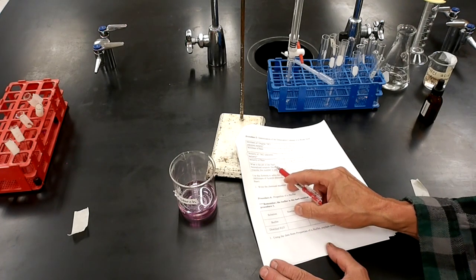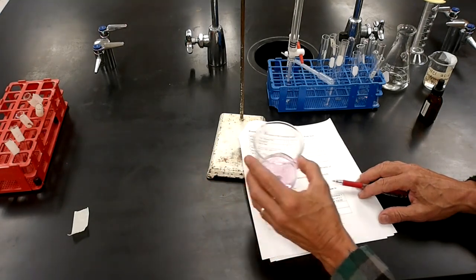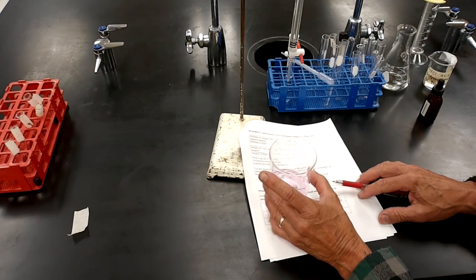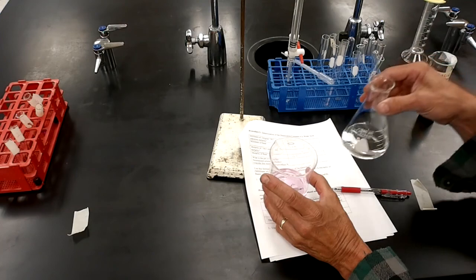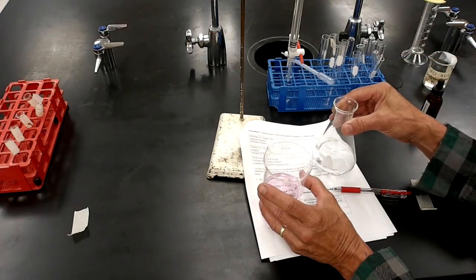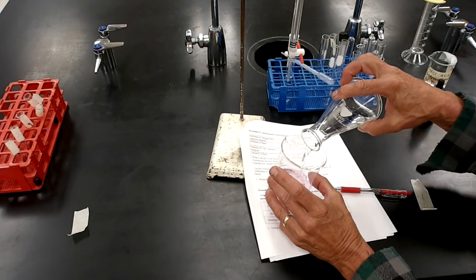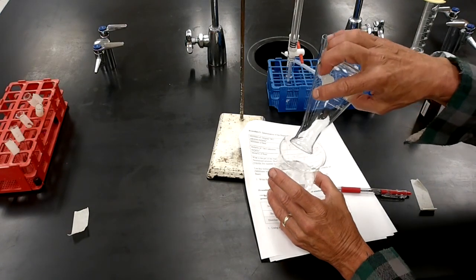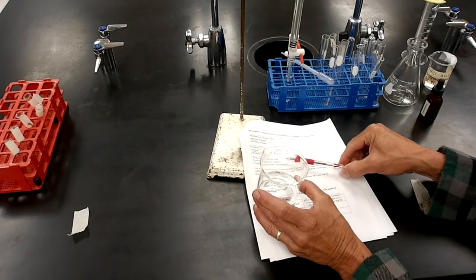Now, what is the pH of the half neutralized solution? This is for procedure 4. So this acid has now been neutralized. It's got a pH of 7. There's no acid in here. This is neutralized. The other half I saved from before, this is not neutralized. So if I take these and combine them, this is what they're calling a half neutralized solution.